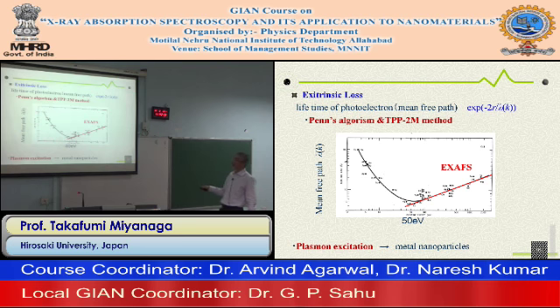At lower energy, the electron mean free path increases, and at higher energies it increases linearly with energy. So a lower energy electron has a long mean free path.